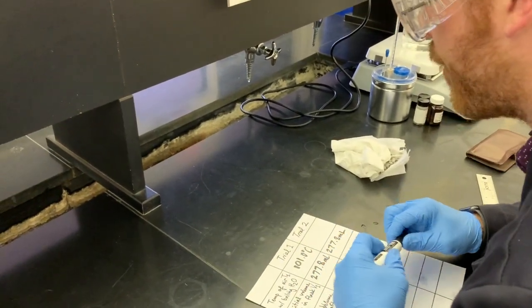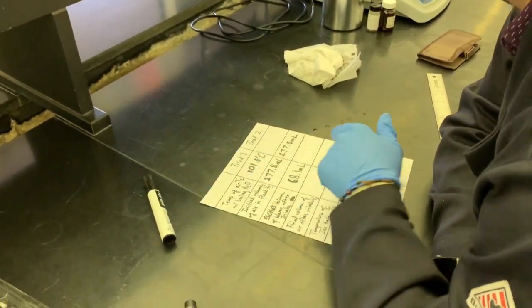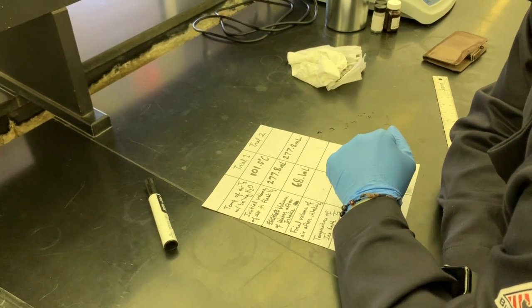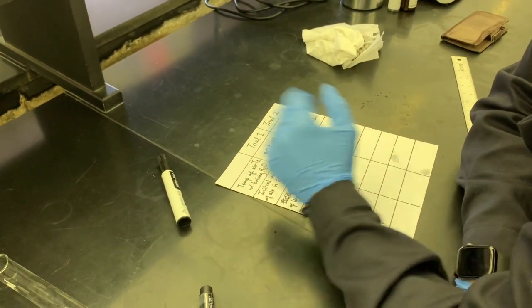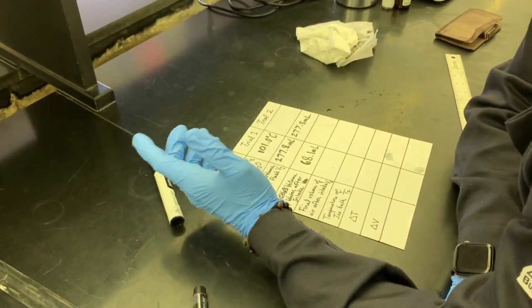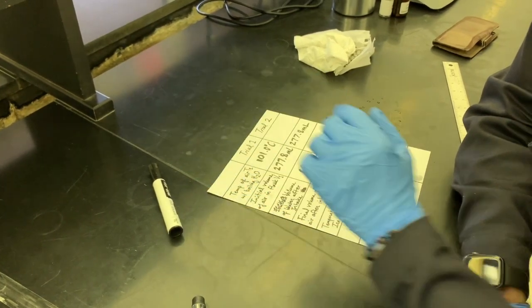If you're using the same flask, this is possible. If you're using two different flasks because you want to speed things up, you could always do two separate entries. I prefer to do just one, and as long as you're working with just air in the environment around us, it's going to behave the same way, and you're not going to have much of a problem there.